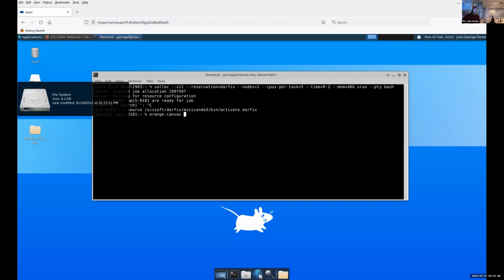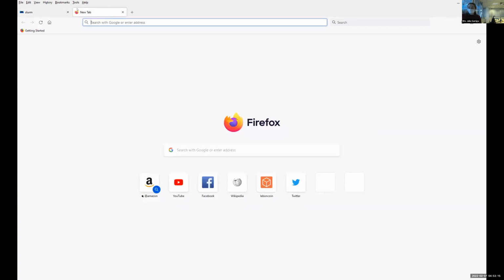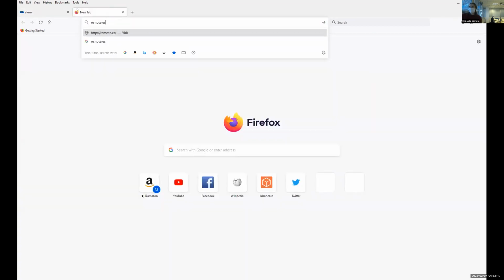So Emilio's telling us that there's a problem with this. But our workspace and your workspace in Guacamole. When you enter through Guacamole, which space did you choose? You had to go into Slurm. Maybe we should show that. Yes, because there's the teleworking and there's the other part.